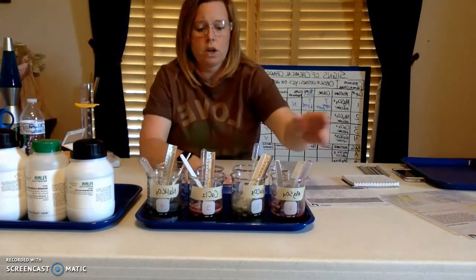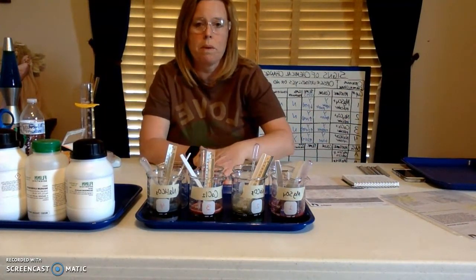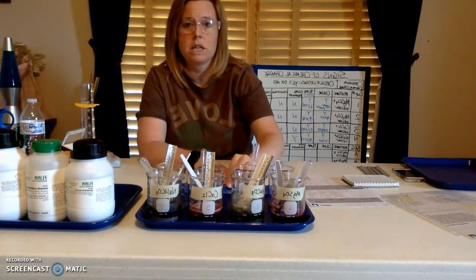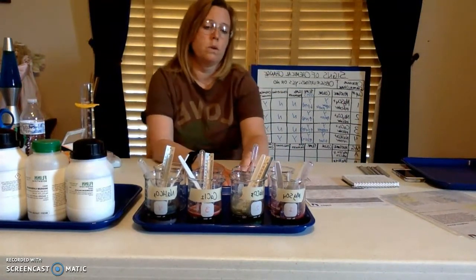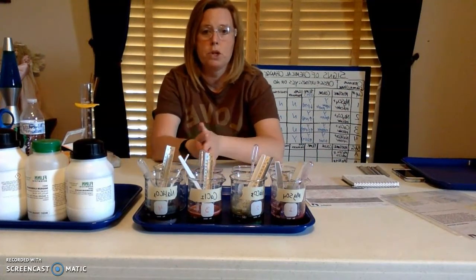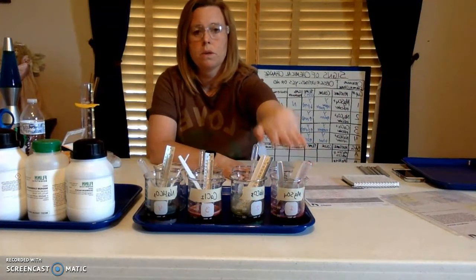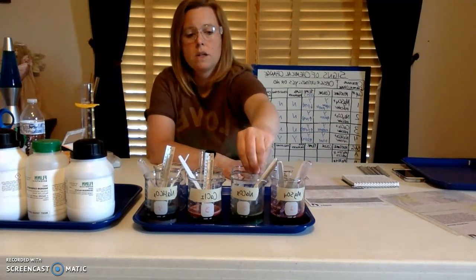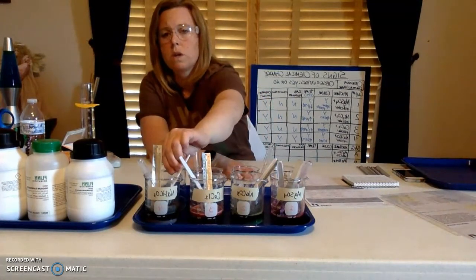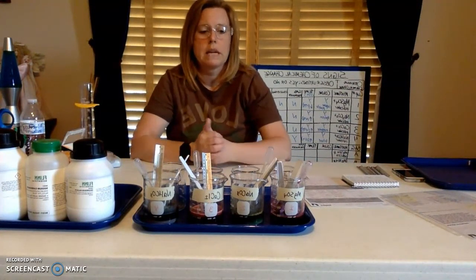So I took my indicator. I'm going to get to this one, the calcium chloride, still warm on my tabletop from the chemical reaction. Remember, temperature change, without me having to set it on fire. So I used my indicator, my blueberry, it'll say cabbage juice, same type of situation, still an indicator, and I mixed it with magnesium sulfate and my sodium carbonate and my calcium chloride and my sodium bicarbonate. And you can tell, and I will take a picture.